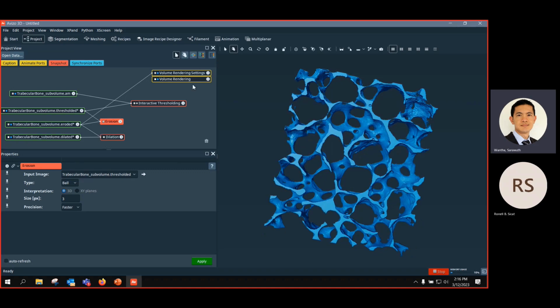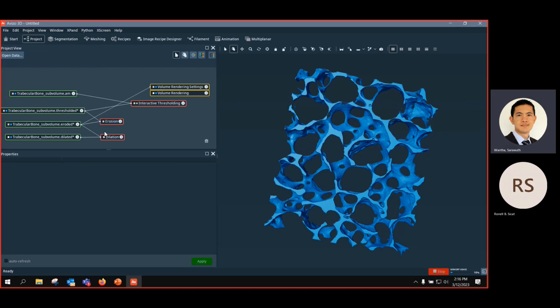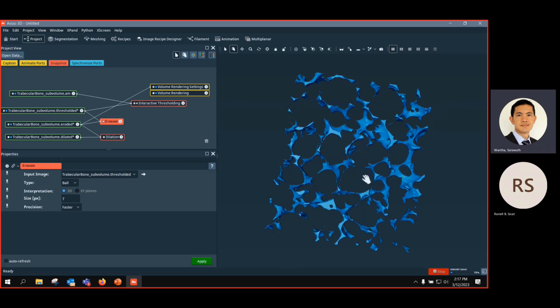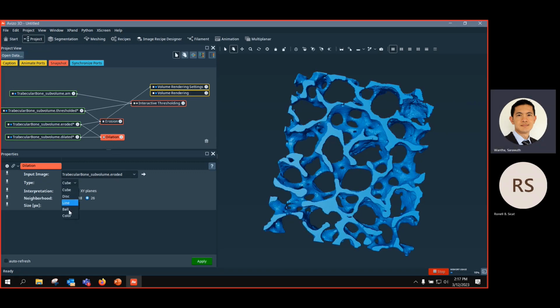Yeah. So it's strange. Erode by ball 3, and then dilate it back. Oh yes, because if you look here, before it was very thick, and then you break apart at 3 or maybe more. So let's say 7. You can see that when I eroded a lot, some parts are already breaking. Okay, most parts are breaking, and then I want to just bring back whatever is left by dilating it back. So it should be ball and 7, same dimension.